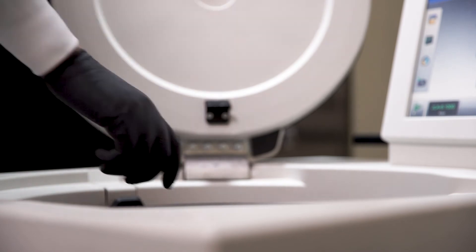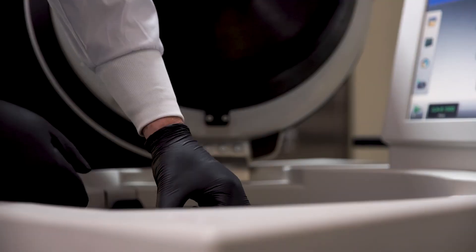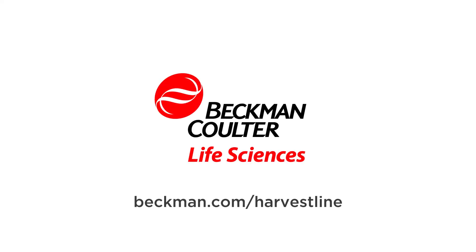Centrifugation can now be carried out without need for any modification of run parameters. After centrifugation, the pellet resides in the liner for easy collection. For more information on Harvest Line system liners and sample recovery, visit Beckman.com/harvestline.